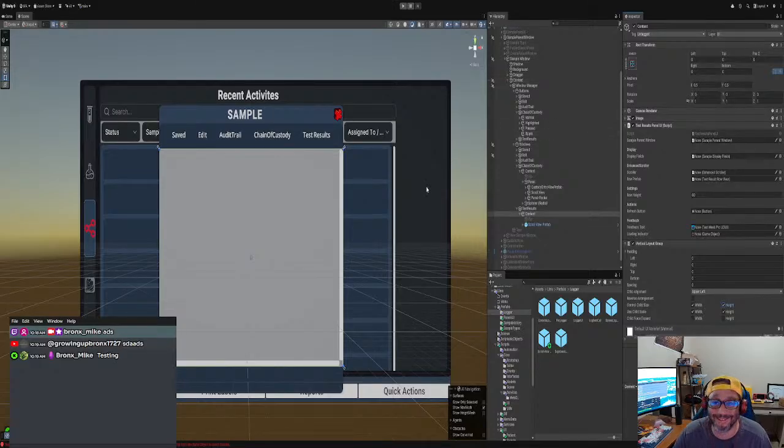Okay. Oh wait, you're not there. You're here. All right, so what we have is the test results. Let's make a prefab for the test results, right? So let's look at the test results, edit. Okay, so enhanced scroller prefab, right? We've got to make sure we display everything that we want. So highlight color, test results data, and so on.